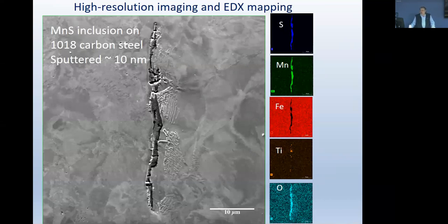It's the XPS, there you can have a bit better chance, but XPS doesn't have this kind of image resolution. So unfortunately, you have to do it differently. For example, we combine EBSD with elemental analysis to see certain crystal structures and compounds.